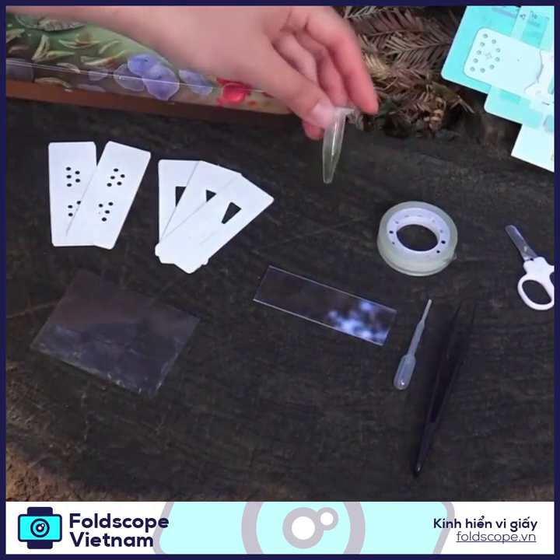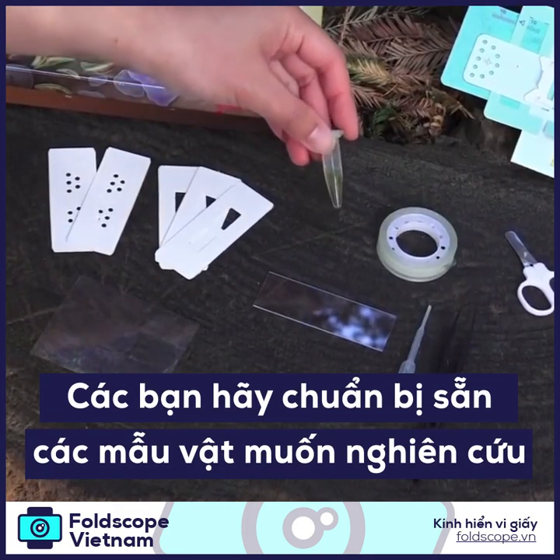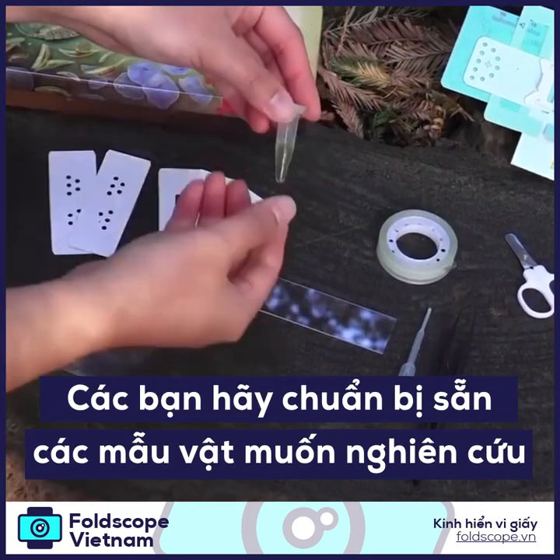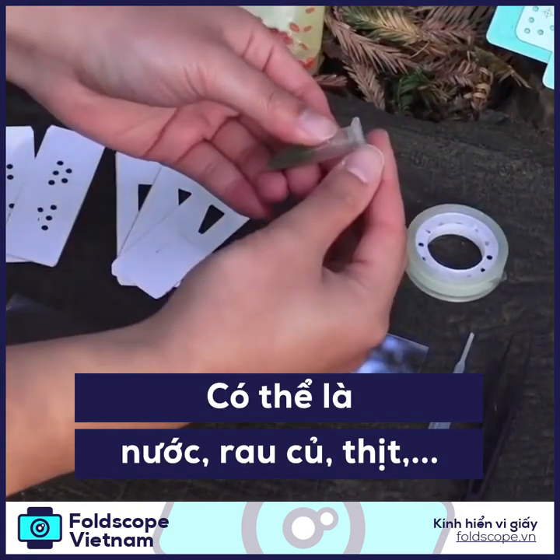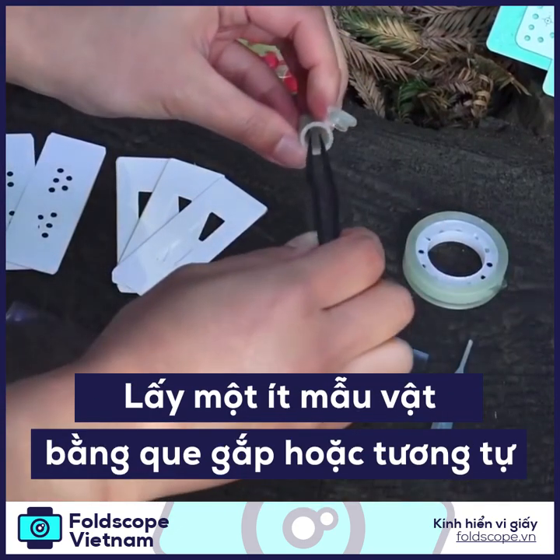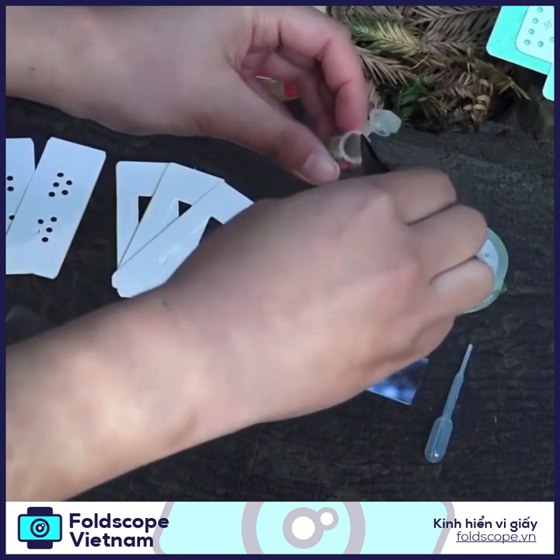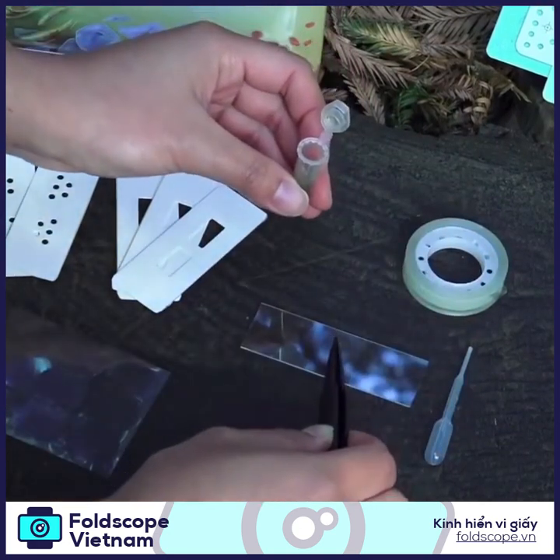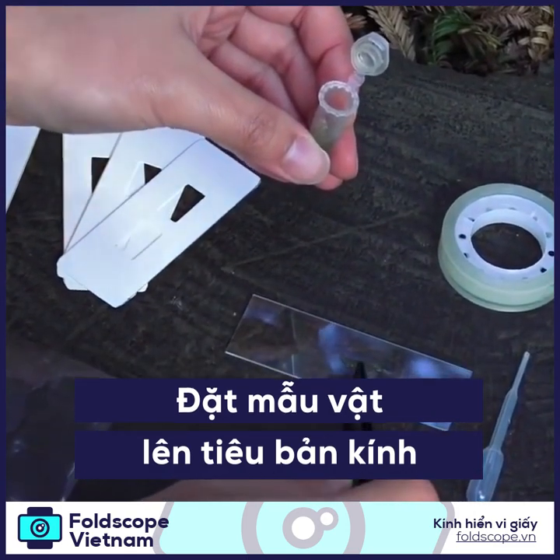I have here some water and algae sample that I took when I was going out with my friends at a picnic. So let me just take a little bit of sample here and just place it on top of the glass slide.